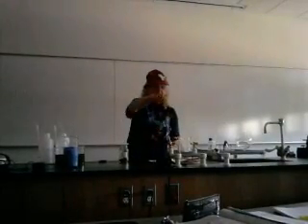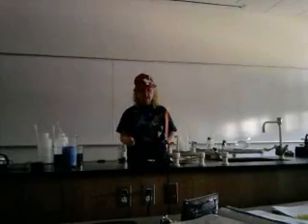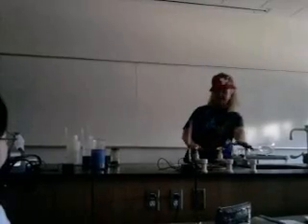Okay, I'll just do a little bit more. So what's happening? An oxidation reaction. Oxidation reaction, yes. Was that a spontaneous reaction? Yes, it was. It happened on its own. Now I have to really make sure I didn't spill this. Okay, all right. So, okay, so I have a redox reaction.